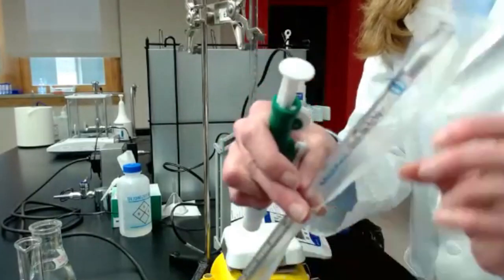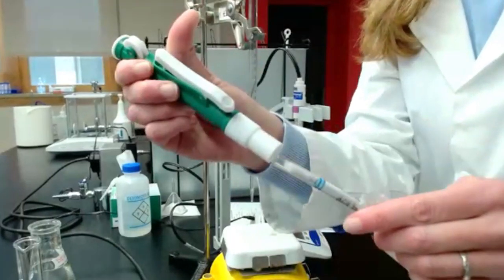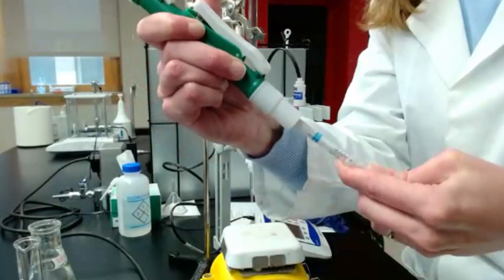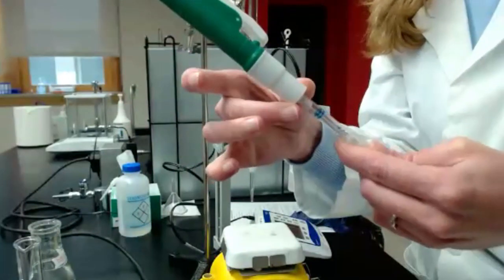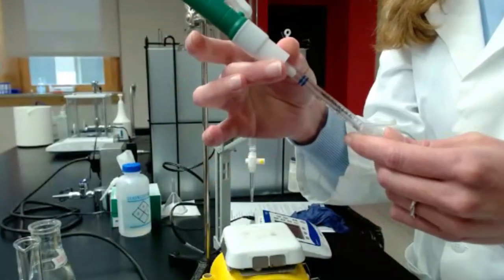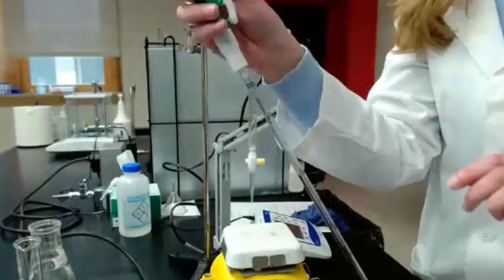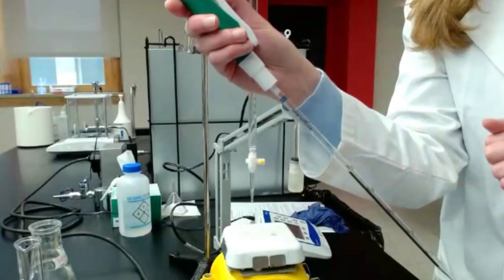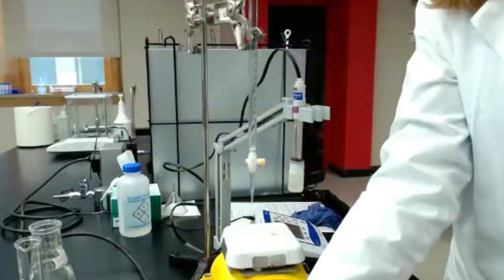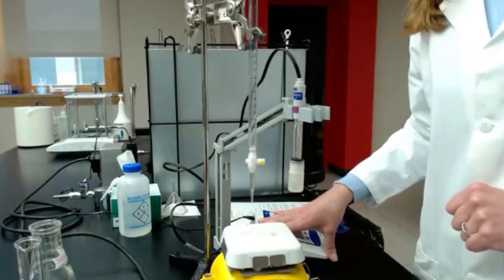You're going to put that pipette on top of the pipette pump, making sure it's handled correctly, closed, and easy to hold. That's what you're going to use to pipette the juice. So that's what you should have. You should have a pH meter.